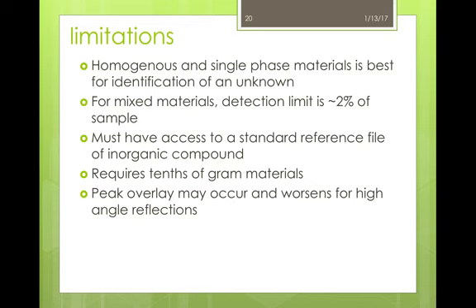Other limitations for this process are that there's a sizable amount of the material needed in order to run the test. So if you don't have very much of your sample, it will be a challenge or impossible to run XRD. Lastly, if the sample is being run at high angles, there may be peak overlap, which causes inaccurate peak profiles.